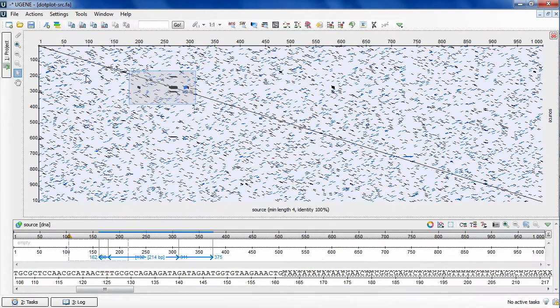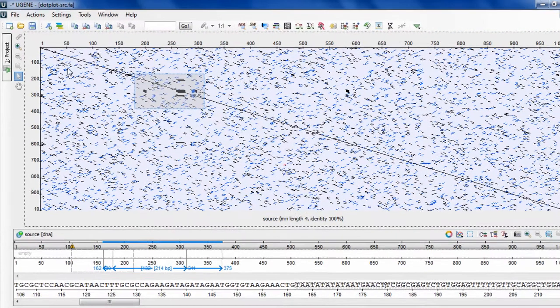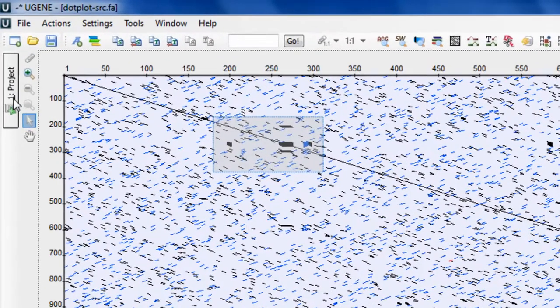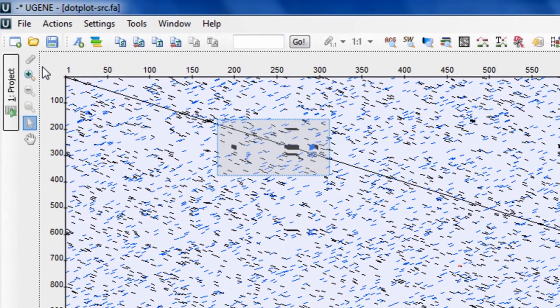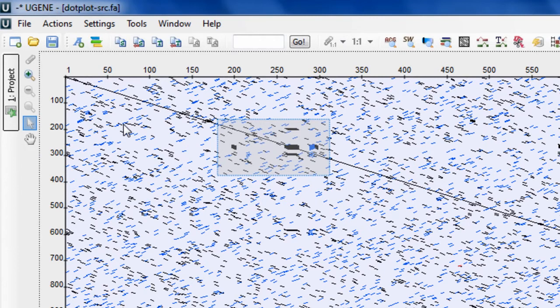The dotplot plugin tool palette is extended with new instruments and overall working experience was improved. Zooming. There are three new tools for zooming operations.